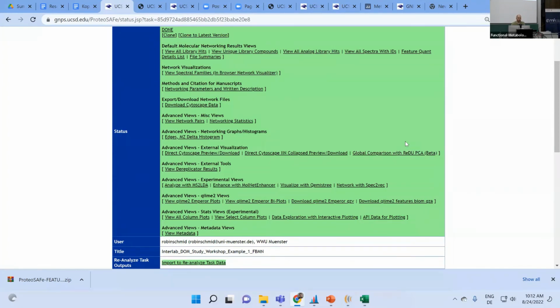So feel free to explore. For example, you can also download plots from the PCoA. If I click here, or it might be even in the, let me check.